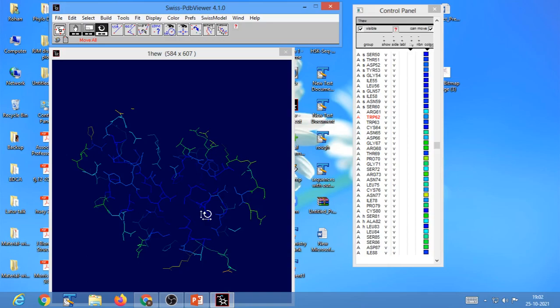With this display of the molecule in cross section, you can see that residues in the heart of the molecule are not accessible to solvent. By taking this slab, or the transverse section of your molecule, what you are looking at is the cut of your molecule. If you cut your molecule right from the center, this is what you would see.